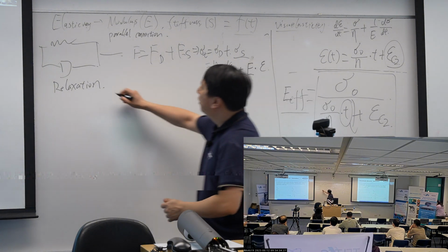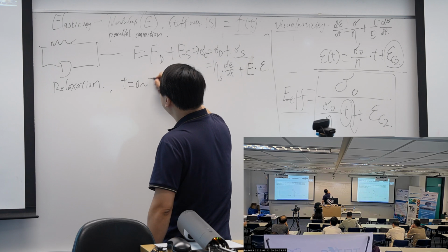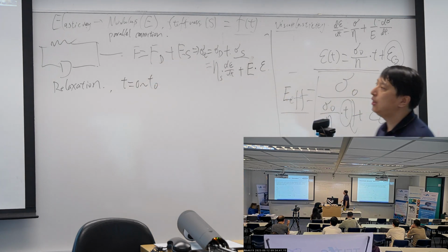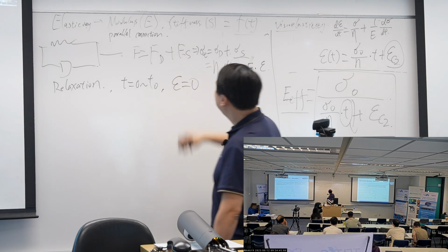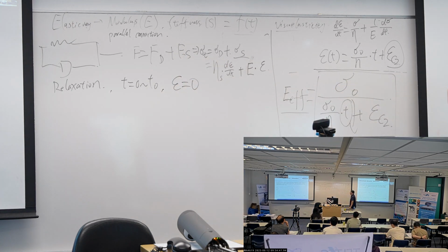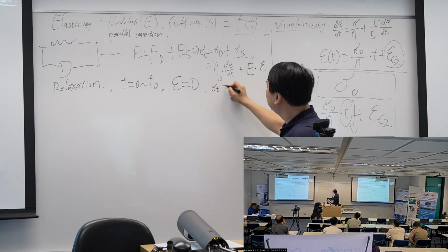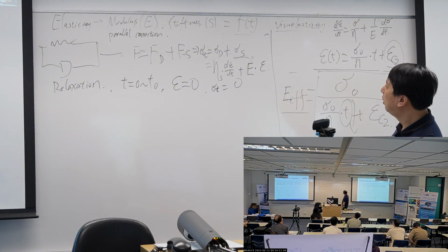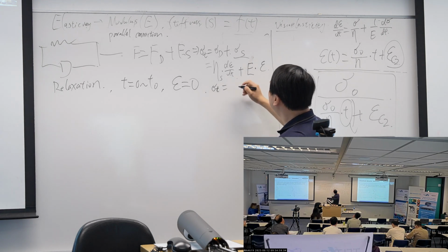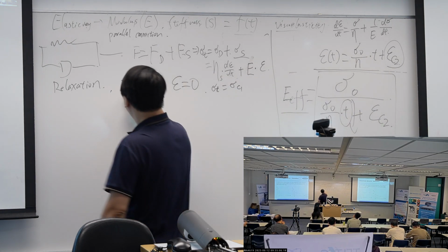And so it's just similar. From 0 to T0, the deformation in itself is 0, and it keeps 0. So my sigma is 0. I'm sorry, it should be also some constant. Play the same games. Okay.